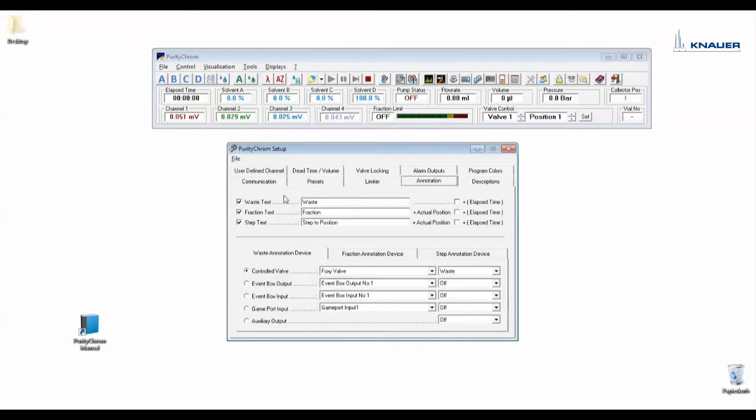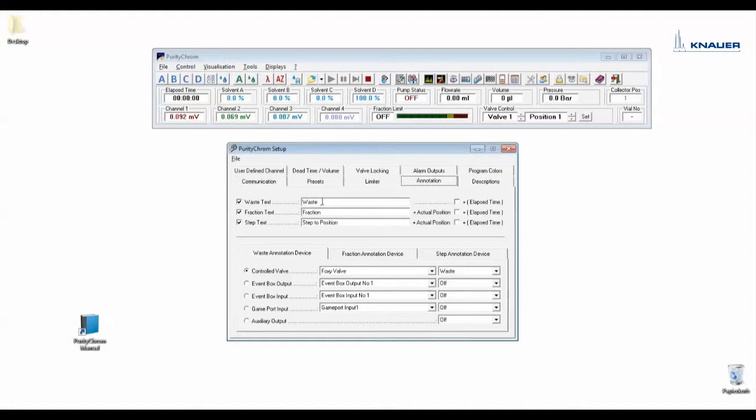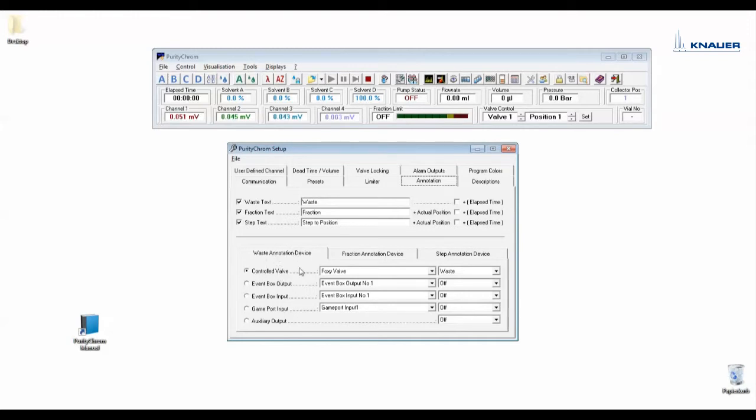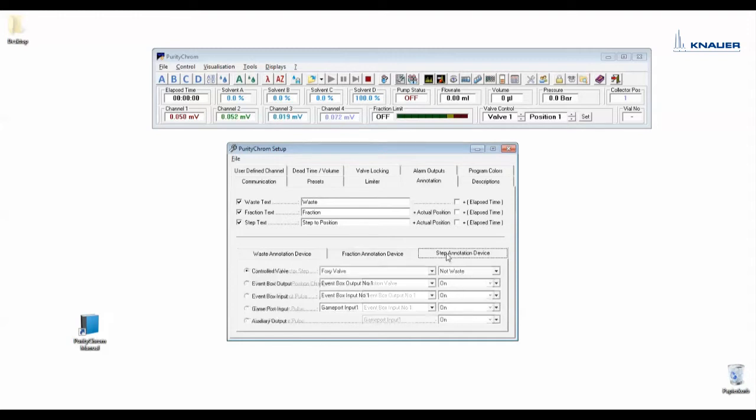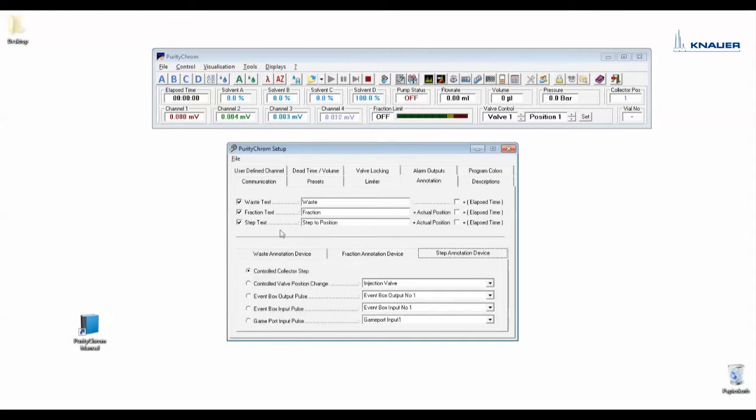In annotation you decide which text should appear if fractionation starts. Here would appear the text fraction. If the fractionation stops here there would appear the text waste. Or if the collector performs a step then here would appear step to position, for example three. In the lower part of the window you choose when the annotation should appear. So the waste annotation should appear if our fraction collector valve is on waste. The fraction text should appear if our fraction collector valve is on not waste. And the step text should appear if the control collector performs a step.